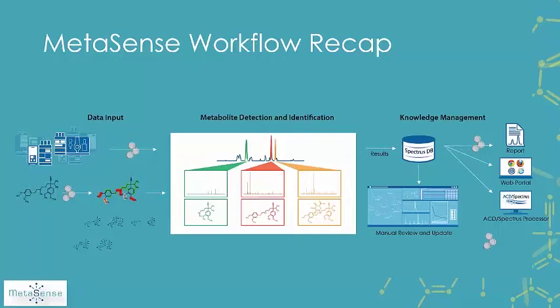So once the data is processed, a biotransformation map gets automatically generated, as well as all of your analytical data, your mass spectra and your chromatograms get attached to each of these structures within the biotrans map. At this point, you can manually review and curate the results. It's here that you can also generate the report, whether it's a paper report, viewing the data or the results through a web portal or through the Spectrus Processor interface.